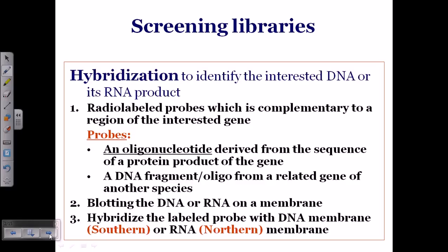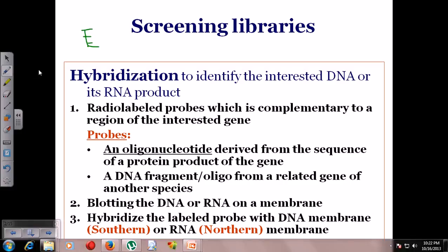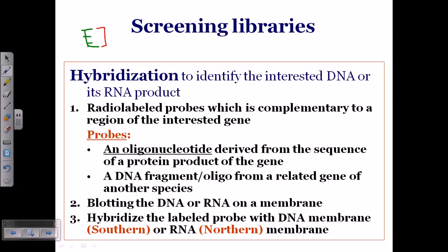Let's go on. So the first kind of utilization that we can get is hybridization. Hybridization means the attachment of a nucleic acid probe with an existing gene of our interest. Suppose this green colored single stranded DNA is the gene of our interest, and we design this red colored probe which is complementary to this gene. So designing this complementary probe will allow us to attach or make a hybrid structure with this desired gene. So this is called hybridization.